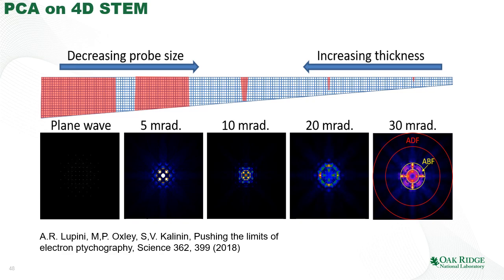One of the areas which grows very fast now is the so-called 4D STEM, or subatomic diffraction, where we use the diffraction from our electron microscope beam in order to explore the structure of the material on progressively smaller length scales.